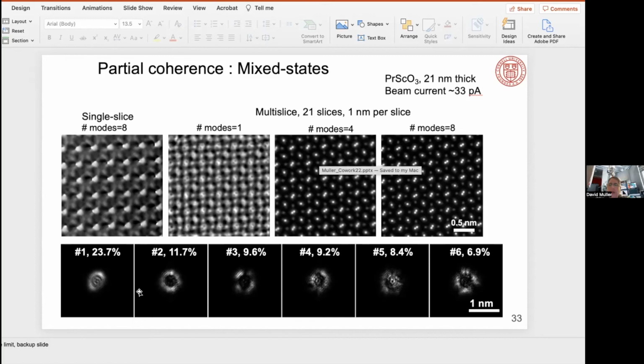This is an out of focus, because when we work out of focus in ptychography, my position correction becomes much easier, because there's a little bit of a shadow image of the atoms in the defocus probe, and that helps with position correction. Early work was all done in focus, and with that, it's very hard to do position correction. But it turns out in focus, the limited number of pixels on the detector does sort of show up as kind of like a decoherence.